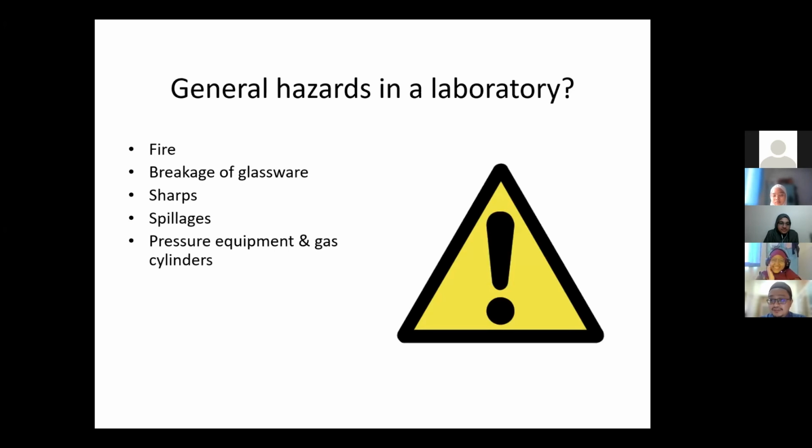Okay, with regard to fire ni, lab kita pernah terbakar. Tak tahu kenapa dekat dalam lab, research lab tingkat 4. Okay, dekat situ ada cell culture, maybe because we have nitrogen liquid tank, we have oxygen tank, carbon dioxide tank, semua kat situ. Maybe some of the tanks leak, ya, dan kita tak perasan. Itu sebab kita kena sentiasa buat check, ya, monthly or weekly even. So nobody realized, then in the middle of the night, yeah, somebody call the dean and said that it's on fire.